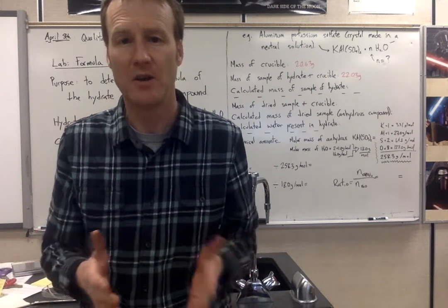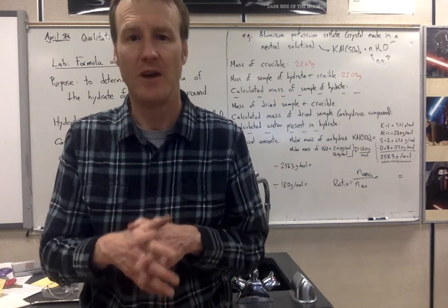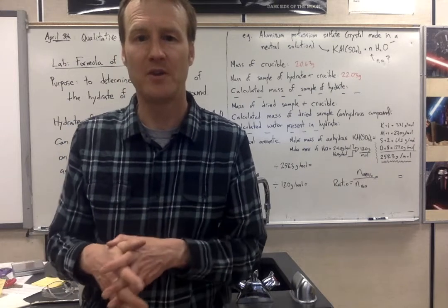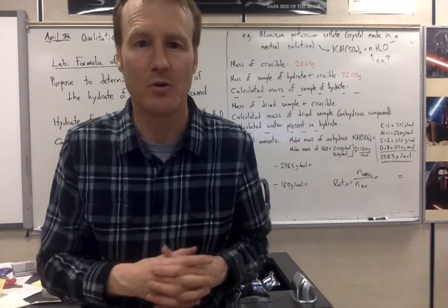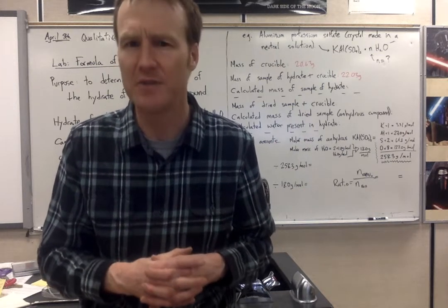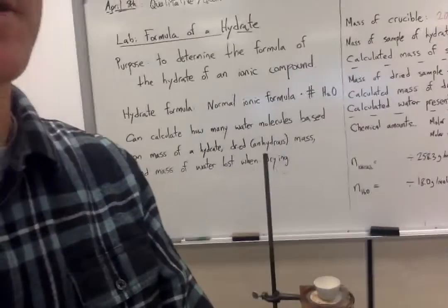In other words, you can figure out what the formula is for that hydrate with reference to how many water molecules are locked up with each formula unit. I'm going to give you air quotes here saying each molecule of the ionic compound. We shouldn't really use that language for ionic compounds because they're in formula units in crystals.